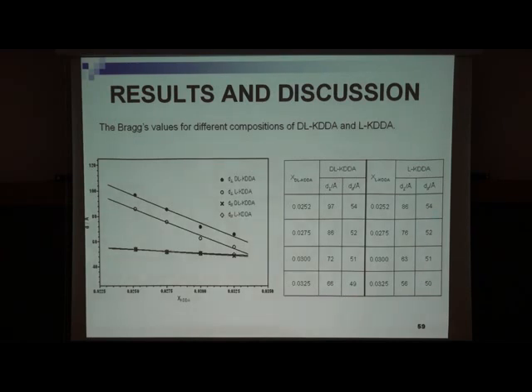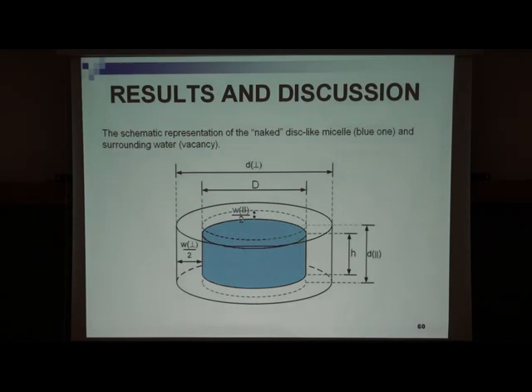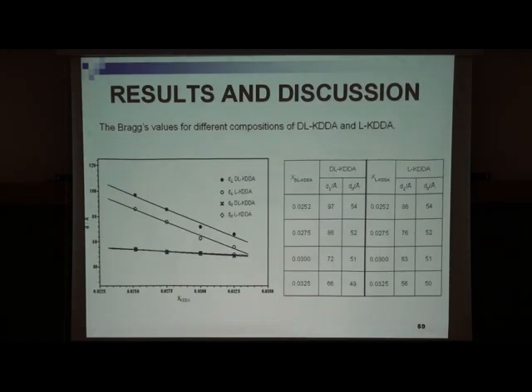At the same time, the parallel values are smaller as the concentration increases. And I think these are the same results for the alanine systems. We have similar values for the serine systems.